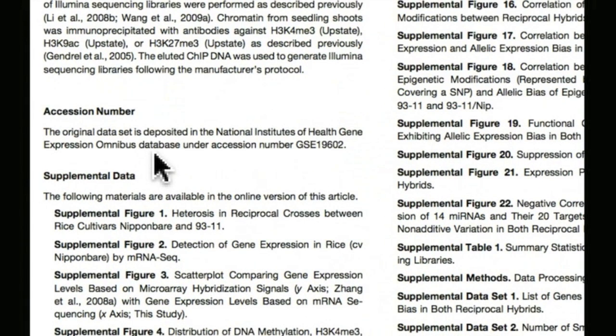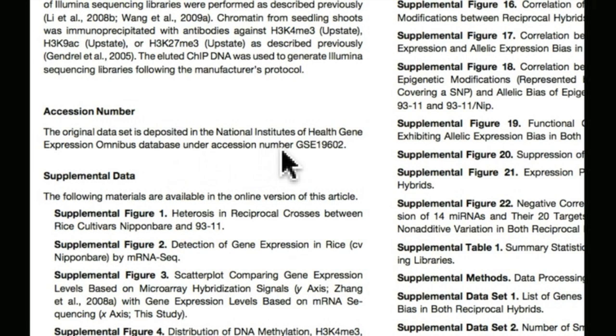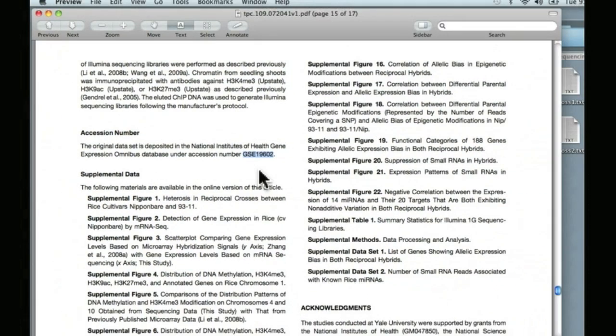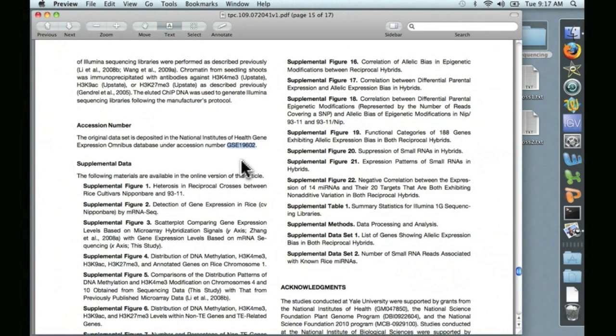And here, this says that the original data set is deposited at NCBI in the Gene Expression Omnibus database with the following accession number. So we're going to go ahead and copy that, and let's open up a browser and go to NCBI.